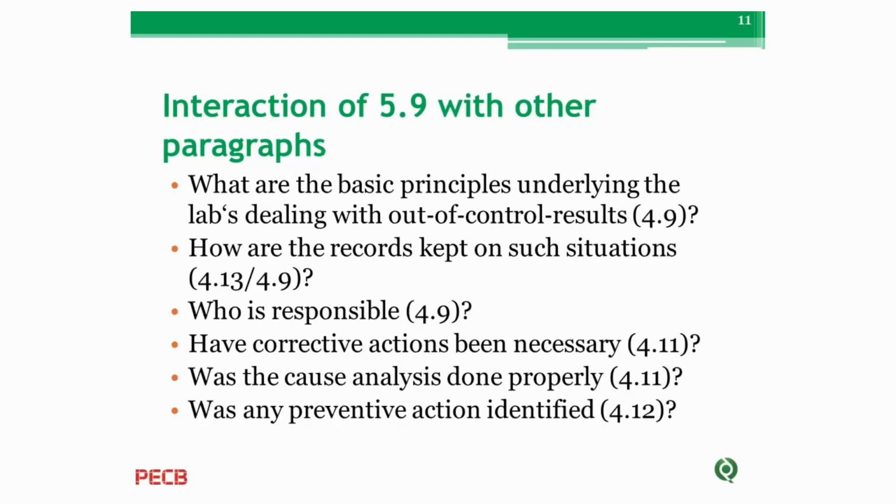ISO standard clause 5.9 has some interactions with other clauses. With clause 4.9, which is about the control of non-conforming work or control of testing non-conforming work. In quality control programs, when we run quality control activities in our laboratories, we may see some out-of-control incidents. It happens in the best laboratory in the world. So we should have a system in place, clause 4.9, in order to manage this non-conforming event. Sometimes we need to stop our routine job in order to prevent the laboratory from reporting a wrong result to its customers.